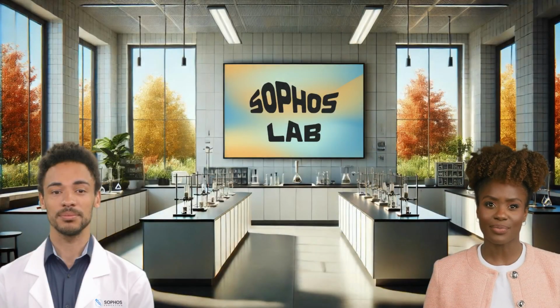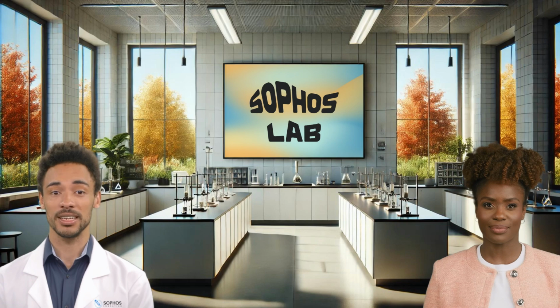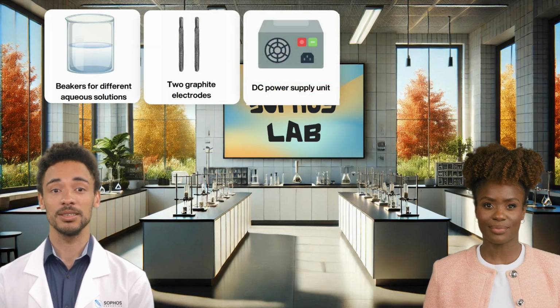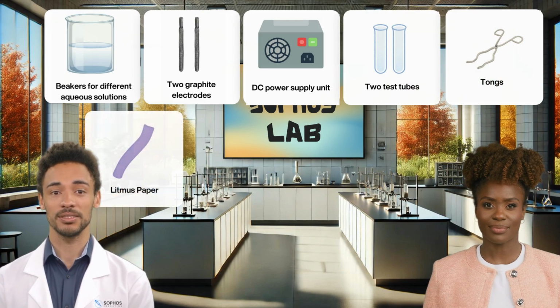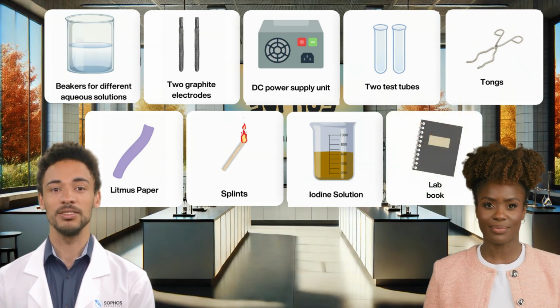On to the practical. Let's start by gathering our materials. Sam, what do we need? So, for this practical, we need beakers for different aqueous solutions, 2 graphite electrodes, a 12-volt DC power supply unit, test tubes to collect gases at each electrode, a pair of tongs for safely handling the electrodes, litmus paper, splints, and iodine solution for testing the identity of gases produced, and, finally, a lab book to record our results.